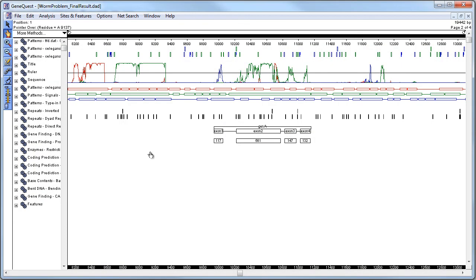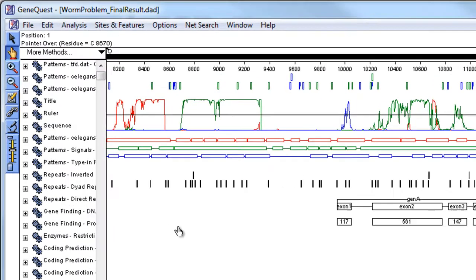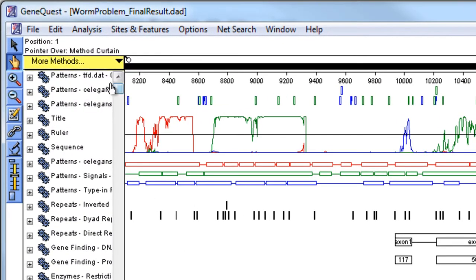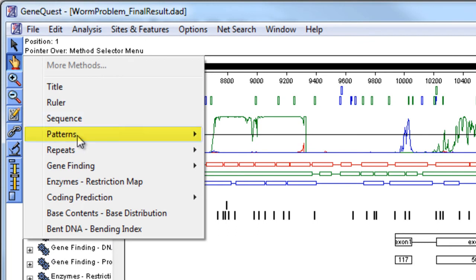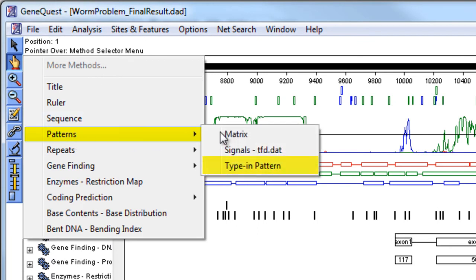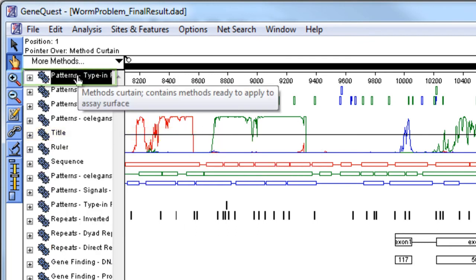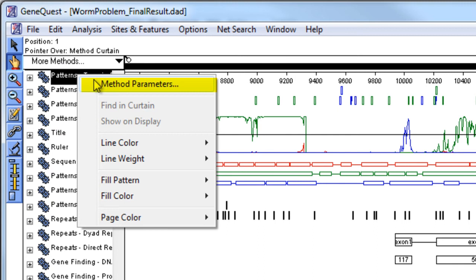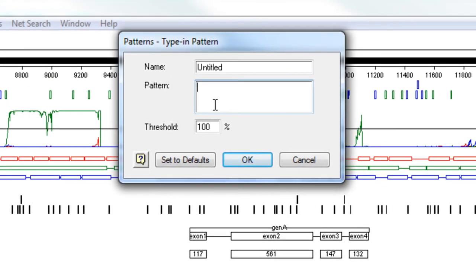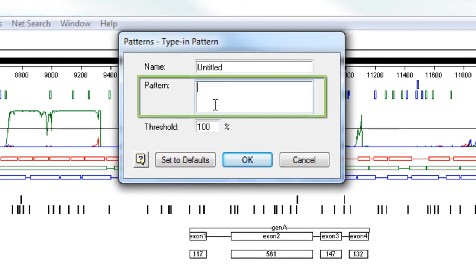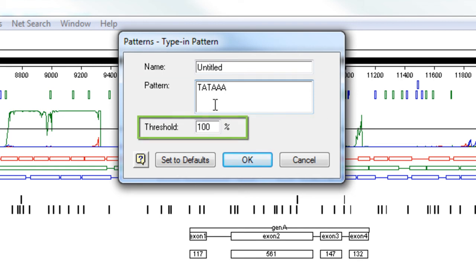Another way to locate transcription factor binding sites is by manually typing in a pattern to locate. To do this, go to More Methods, Patterns, Type in Pattern. Then right-click and select Method Parameters. Here you can type in the sequence pattern to locate. Optionally, you can change the threshold for the sequence match.